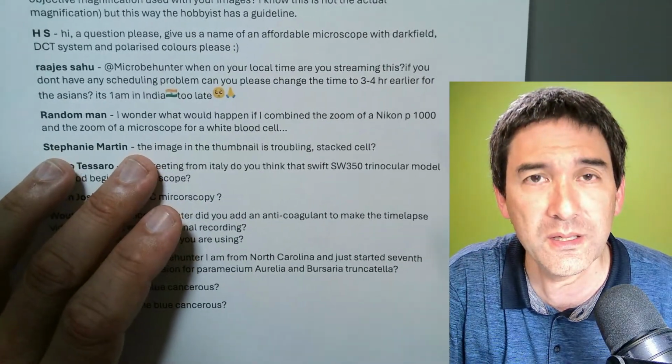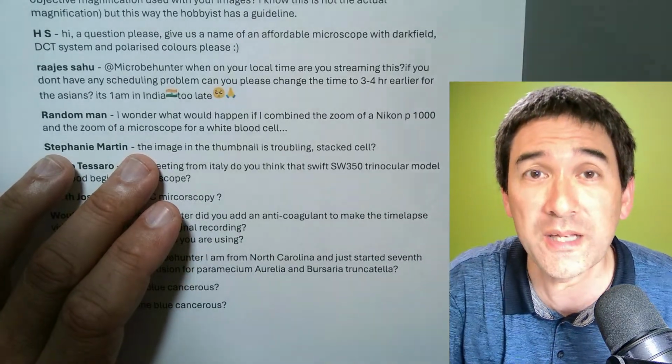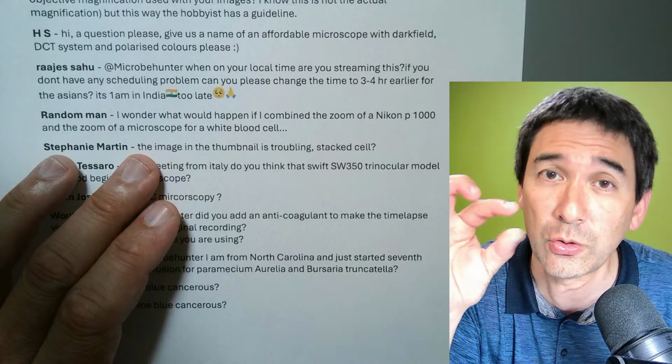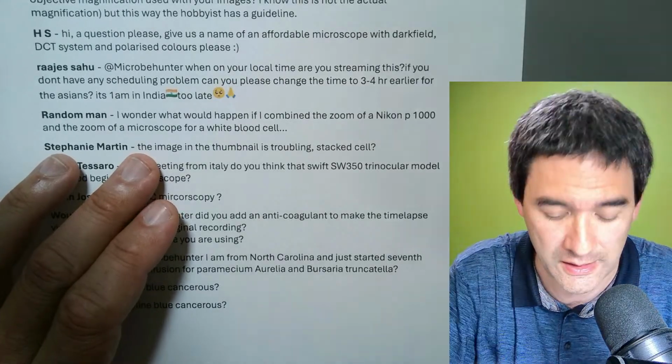And sometimes they don't stack up if I use very little blood, because then they cannot stack up, as they're compressed between the cover glass and the microscope slide.